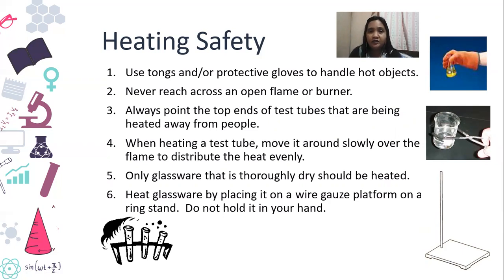Always point the top ends of the test tubes that are being heated away from people. So, for example, let's say this is a test tube and you're heating it from here. Never point this part to the face of your classmate. No, no, no. Always away.